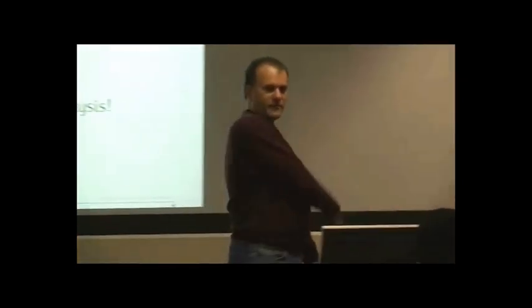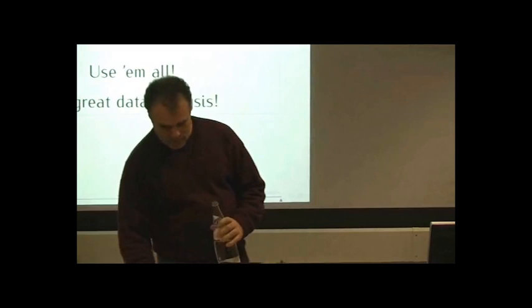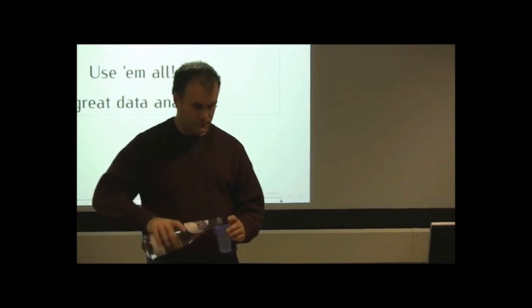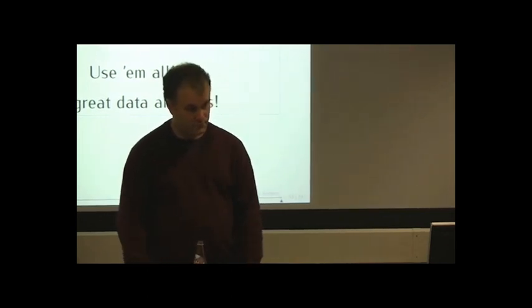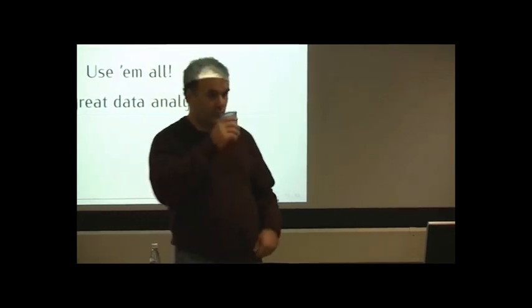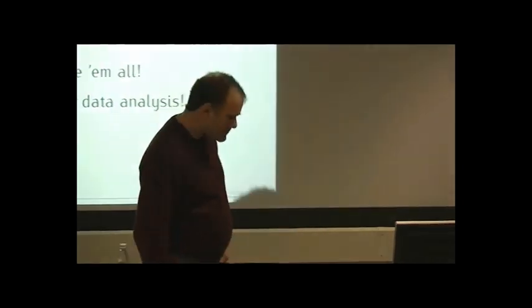Yes? Unlike the multiple data set, for multiple calculation, I guess there will be more parameters that we need to play with. And then if I am interested in delta R more than, say, the sigma square, can we actually fit first the delta R, and then, because we have a limit of independent points, or can we guess, like, if we have the experiment at very low temperature, can we guess that that parameter should be really low number or something like that?